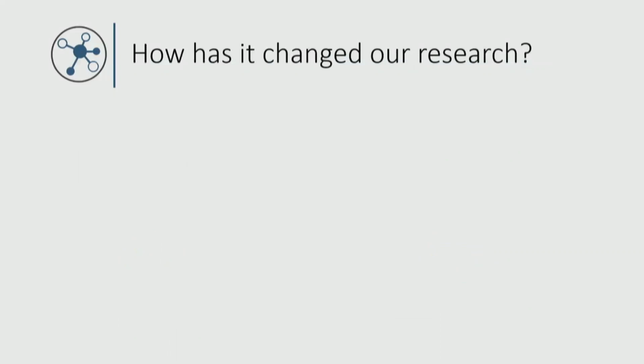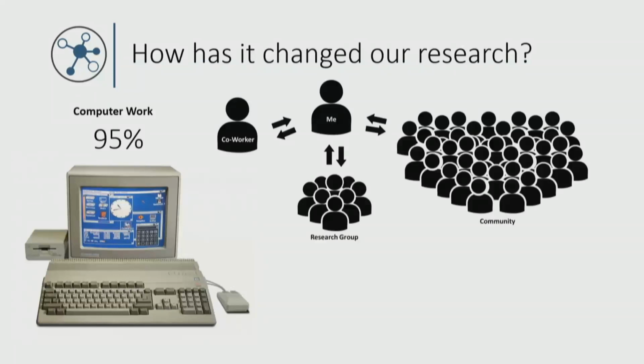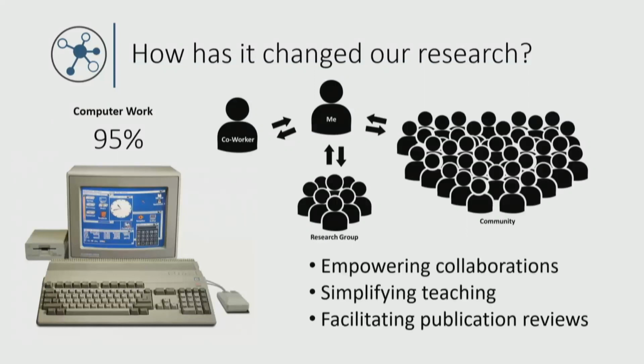All right, thanks, Ming. So yeah, coming back to basically where we started, looking at our work days as mass spectrometrists or metabolomic scientists, I don't think that that's going to change much, but rather probably going to shift even more to the computer side of things. And yeah, we hope that with the GNPS dashboard, we can at least facilitate that communication between coworkers, between small groups, but also between us and the community at large. And yeah, I hope that the dashboard empowers more collaborations that way.